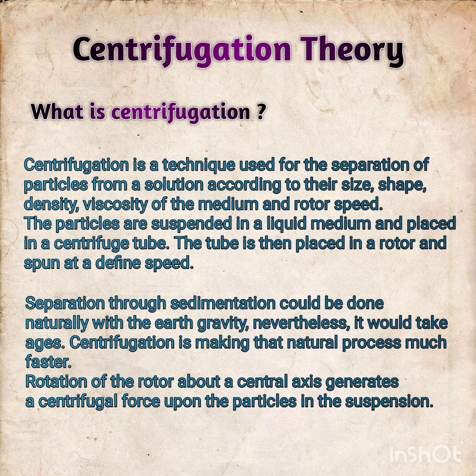What is a centrifuge? A centrifuge is a type of machine that helps in centrifugation. The tube is then placed in a rotor and spun at a definite speed. Got it? Separation through sedimentation could be done naturally with Earth's gravity, but it would take ages, while centrifugation makes that natural process much faster.